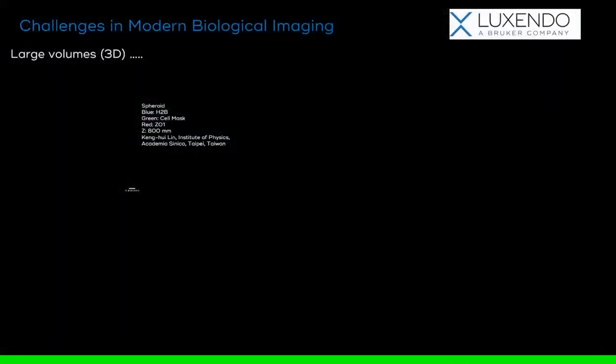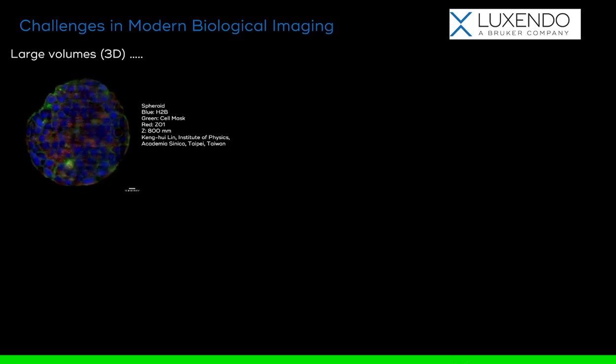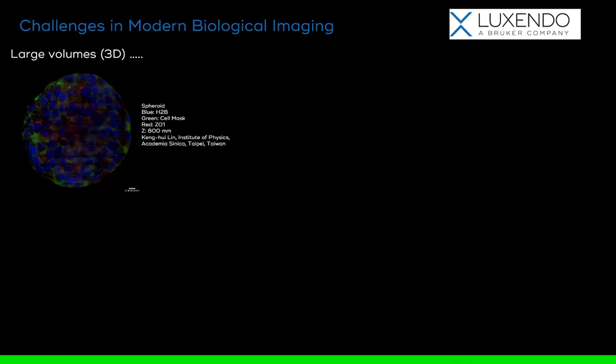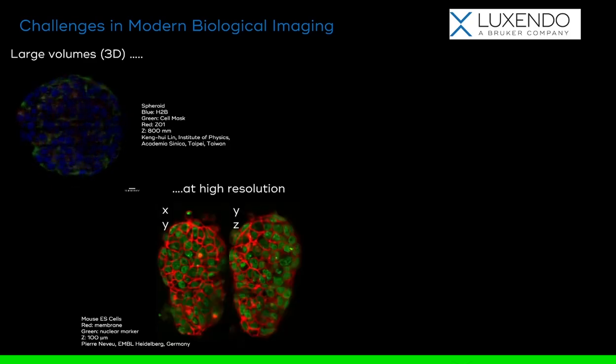To set the stage for the rest of my talk, let's first consider some challenges in modern biological imaging. There's been an increase in the number of labs utilizing whole organisms, 3D cell cultures, and other physiologically relevant systems, and these provide a particularly unique challenge with regards to microscopy. First, researchers have to image extremely large volumes of three-dimensional data. Secondly, they need to capture this data at high enough resolution in order to localize the proteins and organelles of interest.